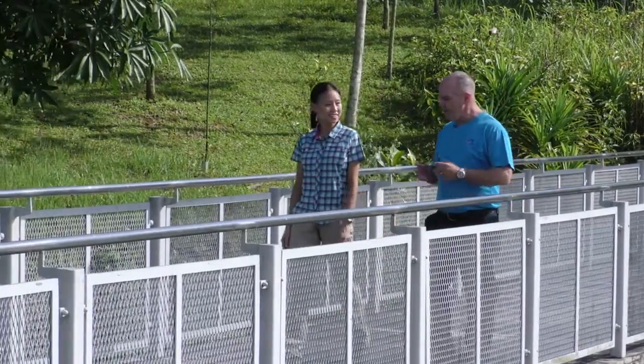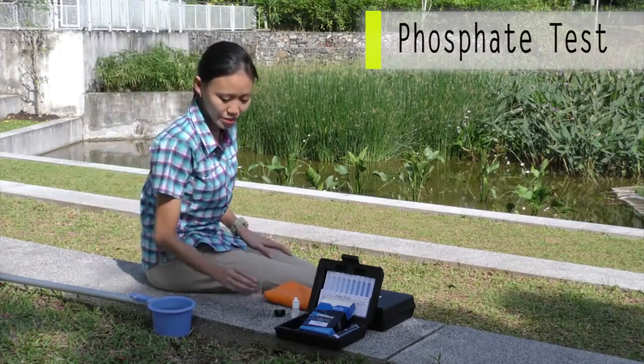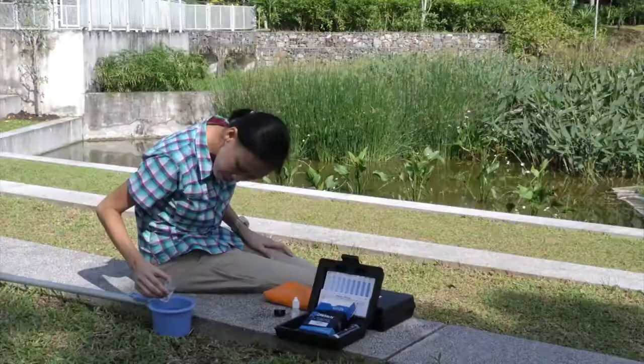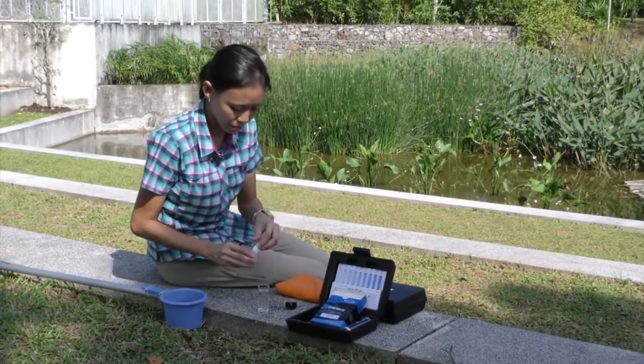Now that we have a basic understanding of both the benefits and the detrimental impacts of macronutrients, Grace, could you show us how to measure nitrogen and phosphorus, please? Sure, Prof. Today we will be using two different kits from Chemmetrics, one for phosphate and one for nitrate. Let's start with the phosphate first. After you collect your water sample, fill the sample cup up to the 25 milliliter mark. Add 2 drops of activated solution.